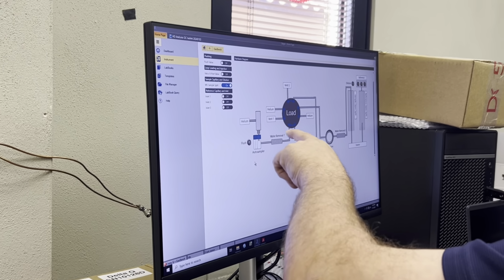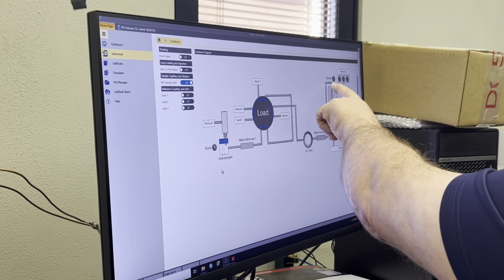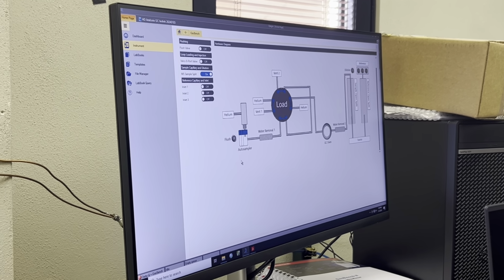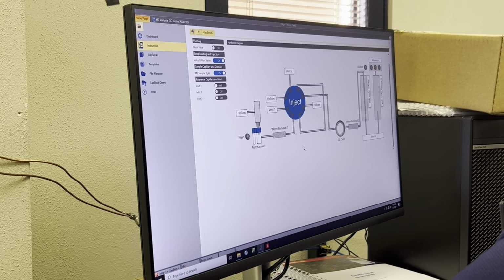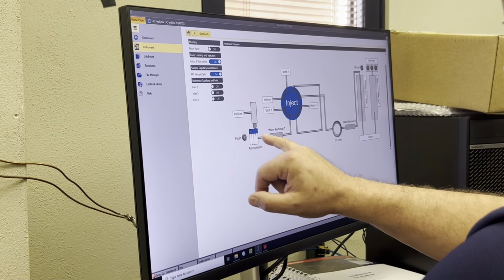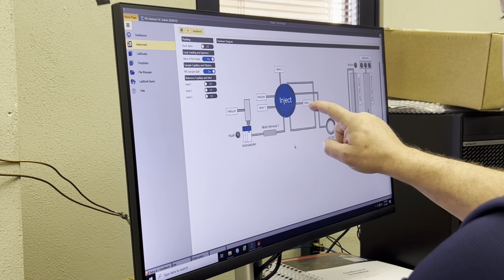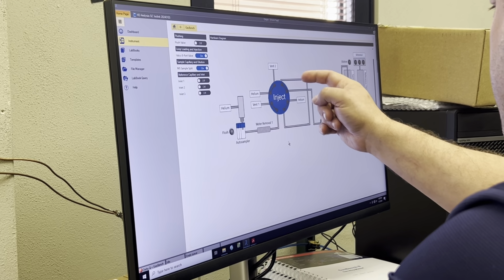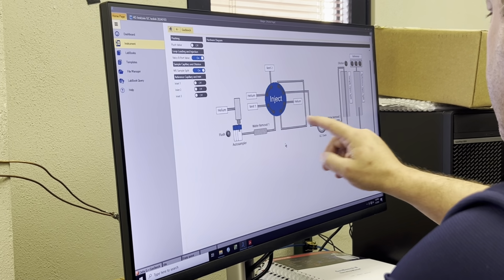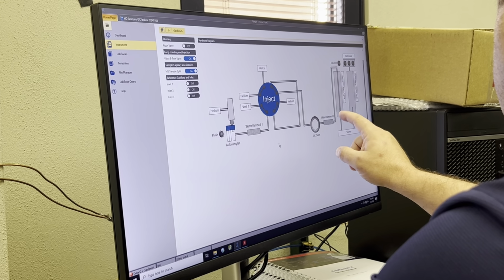You also have another helium flow here that just goes to the GC. It's not doing anything, but when you switch into the inject mode, you've now got the helium from the sample going to the vent, and the helium from this other helium flow is actually flushing the sample to the GC column.